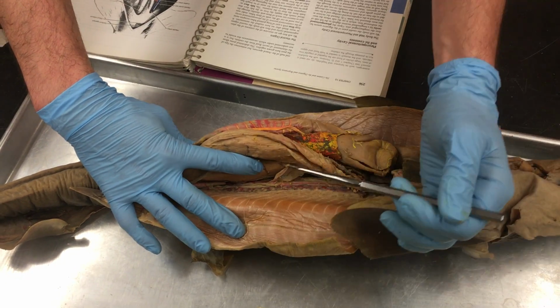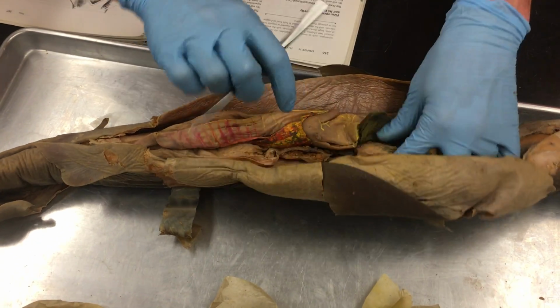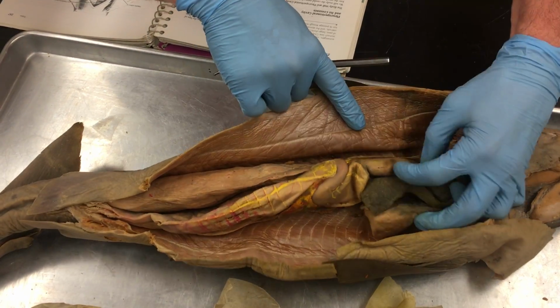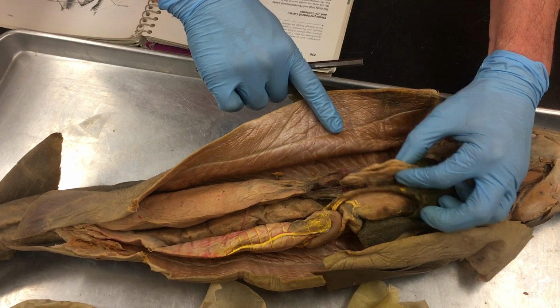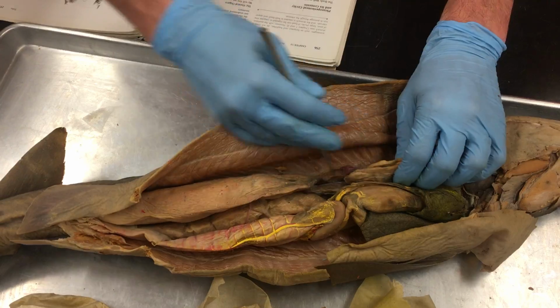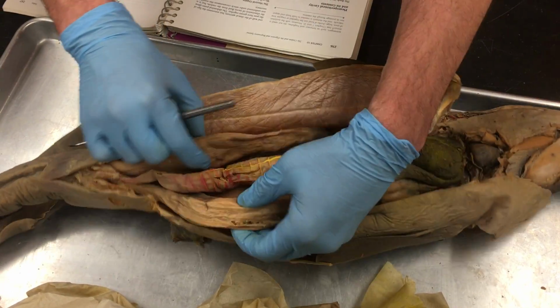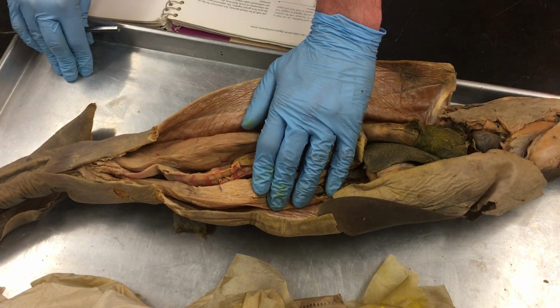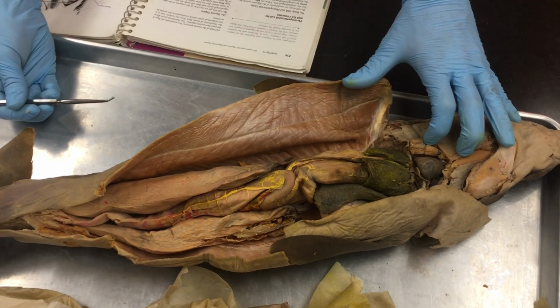The gallbladder, we already talked about that. Gonads, up here. Here's one right here. So since this is a female, this will run down to the uterus, which is down here with developing embryos inside of it. Pericardial cavity, it's where the heart is.